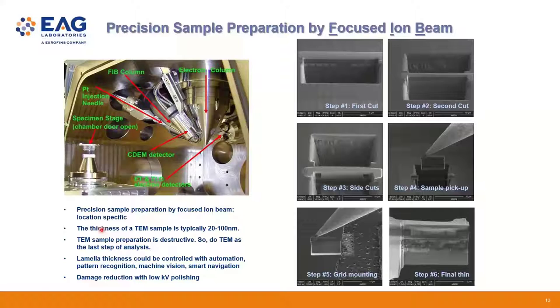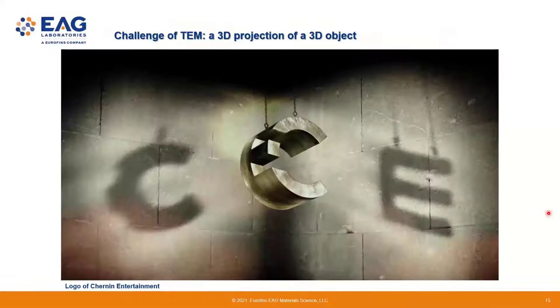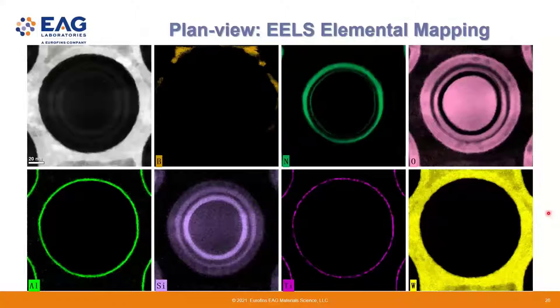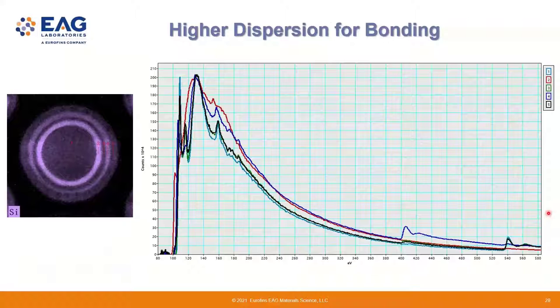Indeed. Okay. So, let's see what else. Maybe we can do a couple more. There was a question about monochromation. They're a little haphazard now with your couple, so I could probably answer that one. Is an EELS monochromator helpful for characterizing bonding or not relevant? It kind of depends on the ionization edge you're looking at. For a very, very high energy loss, it's less relevant because the features are just broadened out. So it really is signal dependent. So yes and no, depending on the signal.